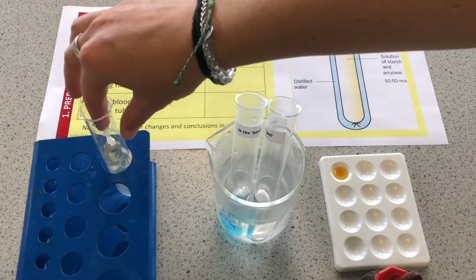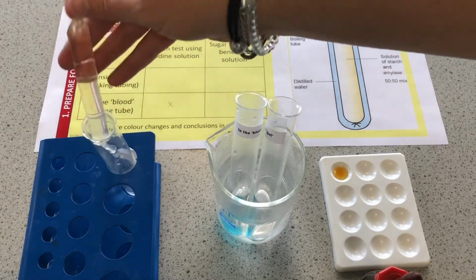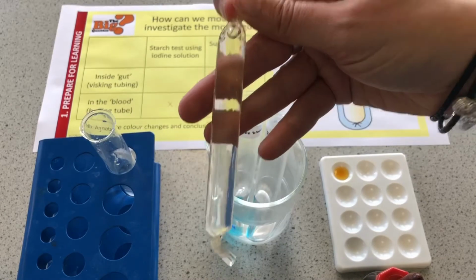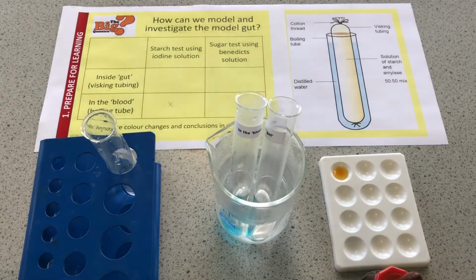Now I need to get into the Visking tubing itself and test the contents of the Visking tubing, which is the small intestine. So this is looking at what is in the small intestine. Now we have a couple of predictions that could be made here. One, all of the amylase may have broken down all of the starch, in which case there'll be no starch present at all. Or if I haven't left it for long enough, we will see some starch.